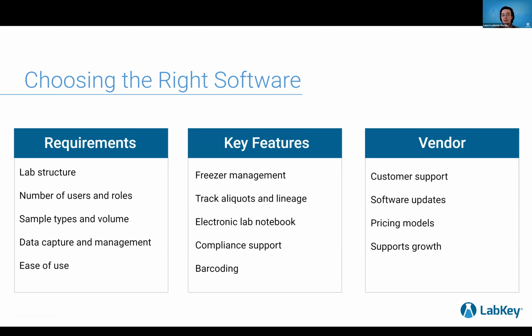It's also important to consider the number of users you have and any special requirements those users may need if they need certain levels of access. And then what volume of samples are you working with and what types of samples are you working with? Can that software support that? And then we also want to consider how you are planning on capturing your data and importing it into the system. Do you want to do it through the software, through importing spreadsheets, or through an API? That's something to keep in mind.